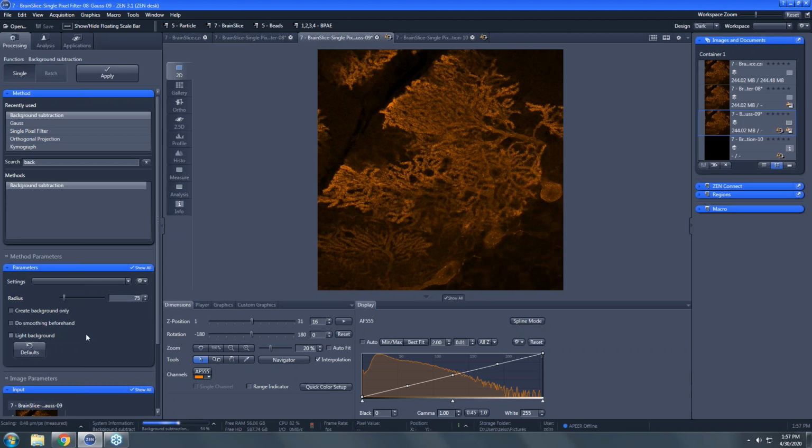We'll just wait it out. Progress bar is at the bottom. You can hear me, and we're at 80% now. We're almost complete. There you go.